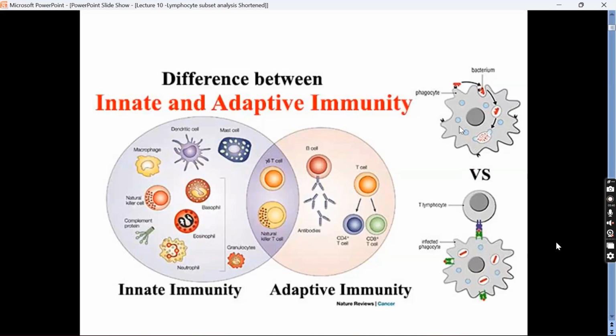The components which I'm covering in this particular course are lymphocyte subset analysis, PNH, CD34 enumeration, of course, and HLA-B27. Though I didn't show you a live case, it's very simple. So these things have to be started. If you have a flow cytometry, you should start these particular assays in your laboratory.